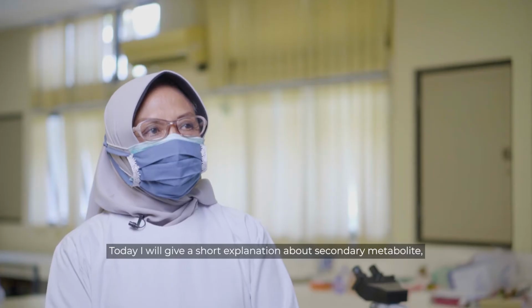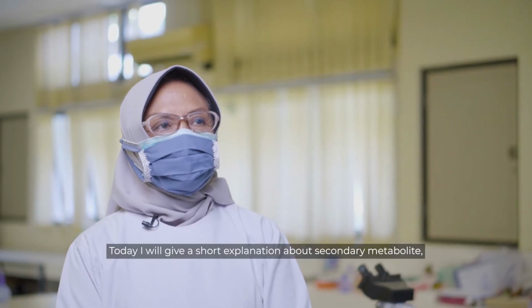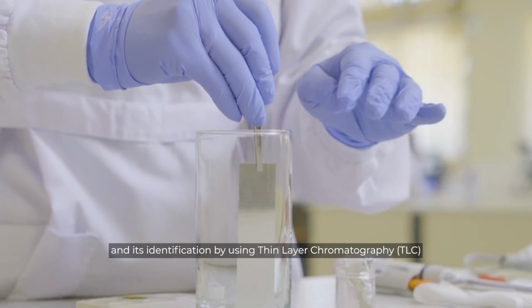My name is Prof. Mai from the Departemen Farmakologi and Terapi, Faculty of Medicine, Public Health and Nursing, UGM. Today I will give a short explanation about secondary metabolite identification by using thin layer chromatography.